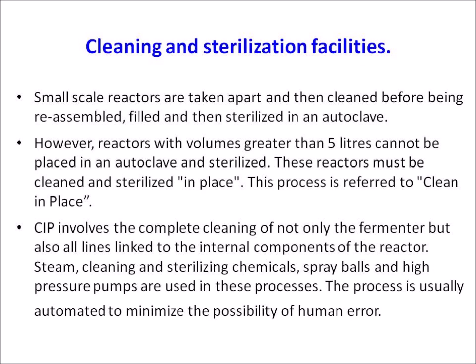Small scale reactors are taken apart and then cleaned before being reassembled, filled and then sterilized in an autoclave. However, reactors with volumes greater than 5 liters cannot be placed in an autoclave and sterilized. These reactors must be cleaned and sterilized in place. This process is referred to as clean in place.